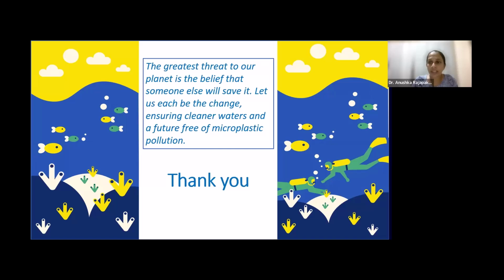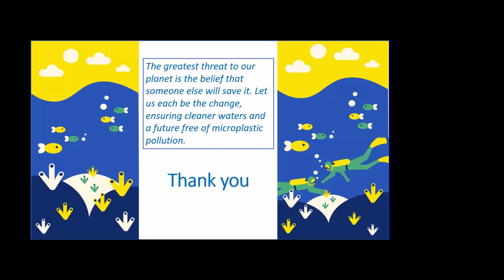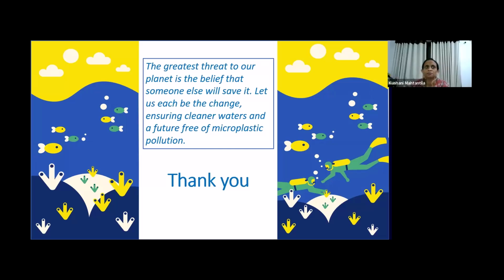There's another question. What is the best method for polymer identification of soil microplastics? Whether it is soil or sediments, we have to separate it from the soil and collect the microplastics first. The digestion and the density separation we have to do before the analysis. Once we have separated it from the soil, we can go for spectroscopy, and I think spectroscopy will work better.